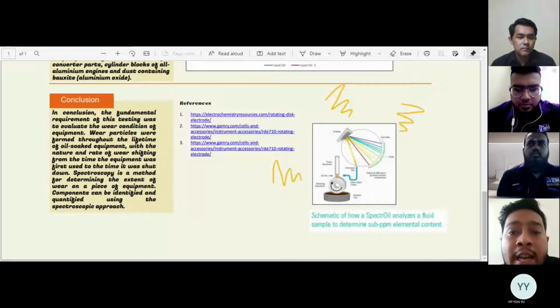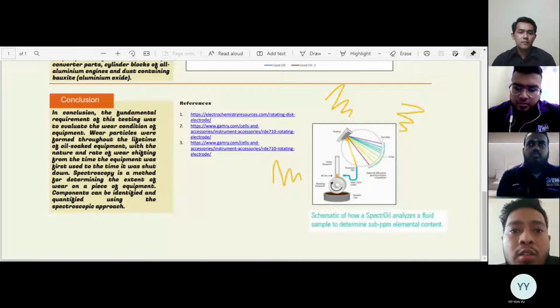The rotating disc electrode (RDE) method, which was particularly developed to burn out any leftover elements in the oil, was used to detect the elements in the oil using a high-purity carbon electrode. Experimentation was utilized to identify the oil constituents using this method. Using this procedure helped determine the suitability of the oil for usage in the machine or system under evaluation. These tests will also simplify any judgment about oil selection that is required. When it comes to any moving mechanism system, it is critical to verify that the oil in the system is of the correct quality and in good working order.